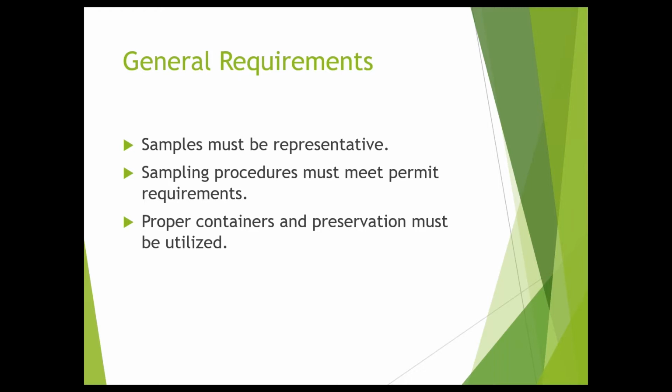Then the third component, the container. You must have the correct container and preservation.